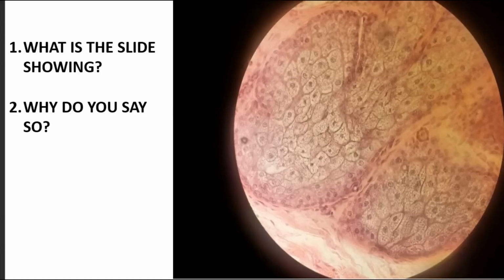This is the first slide. It says, what is the slide showing? So what the slide is showing is the sebaceous gland. So this is the sebaceous gland.